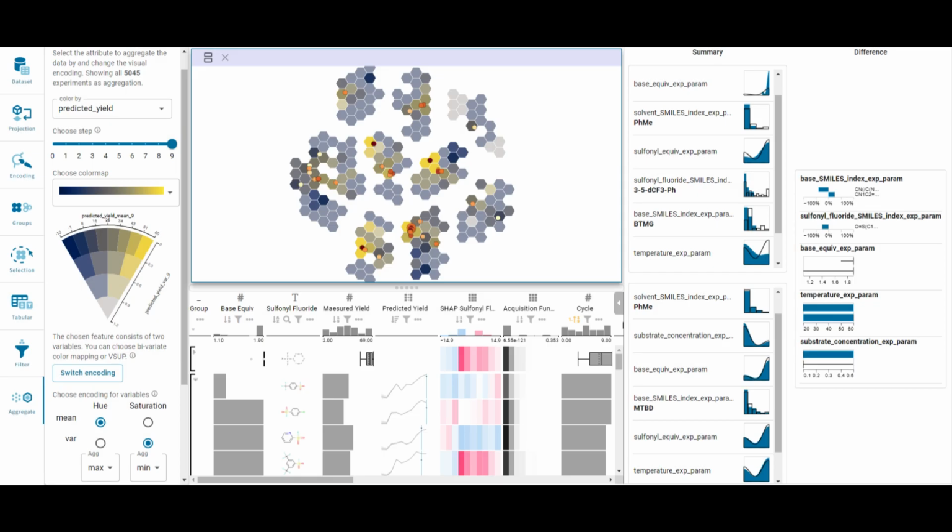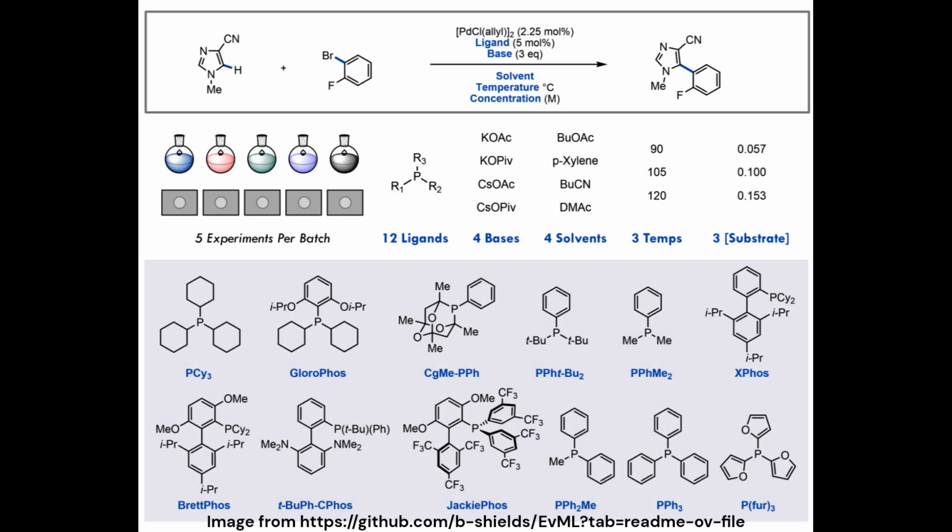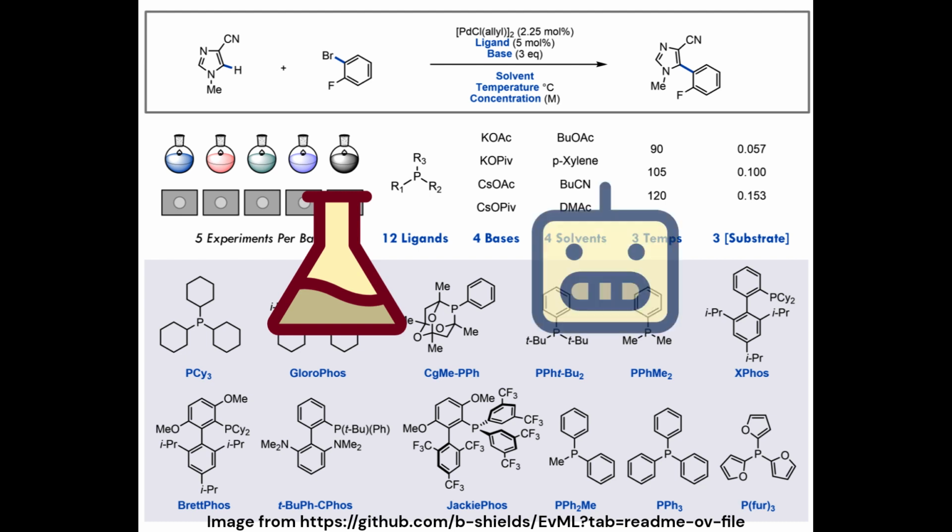CIME4R reaction is a tool that allows scientists to analyze chemical reaction optimization data. In this video, we demonstrate the use of CIME4R reaction with an example dataset. Our dataset consists of the parameters that were adjusted for optimizing our target value, lab measurements of already performed experiments, and the predictions and explanations of an AI that was used for this reaction.